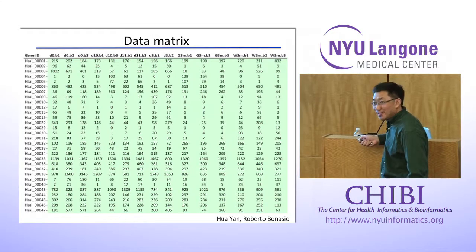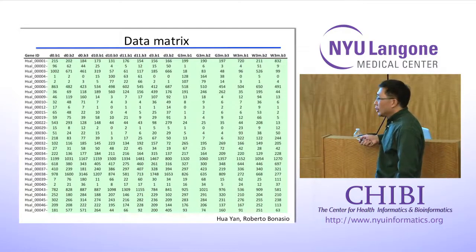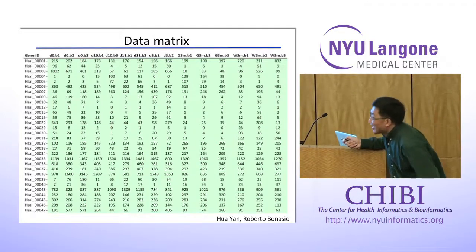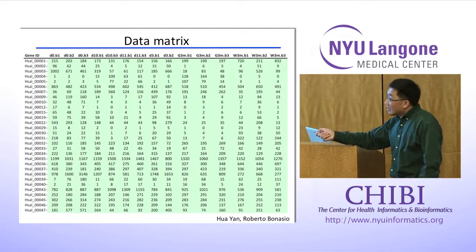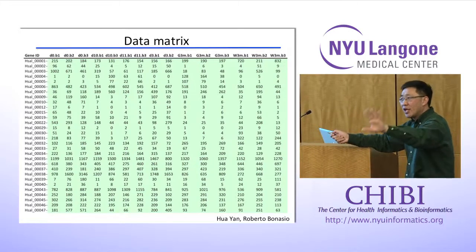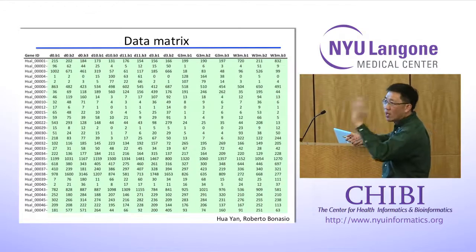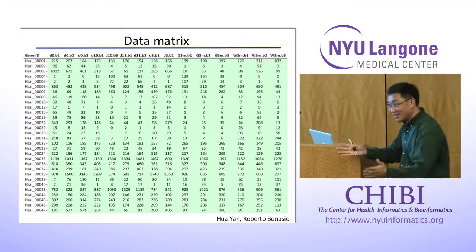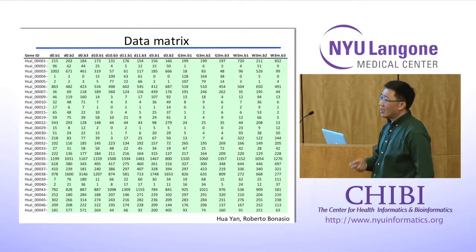However, after gene selection, if you want to do the GO term or some functionality analysis, if those analyses have multiple hypothesis testing involved, then you need to do gene length adjustment. Okay, clear? So then you say, why can't I just do that at the beginning? I say, if you do that at the beginning, because gene length adjustment can bias toward the short genes, those short genes will be lifted during your multiple hypothesis testing. Those guys will get an advantage. So your truly differentially expressed genes will more or less be excluded from your list.